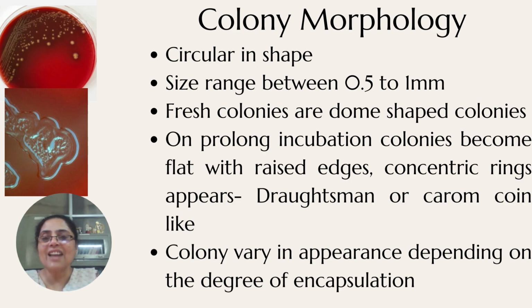on prolonged incubation, it will result like the second image, where what we are seeing is the colony which is aged, and it is having carom coin like appearance, and it is called draftsman colony. So this is what I was talking about, when the colony is incubated for a longer time.